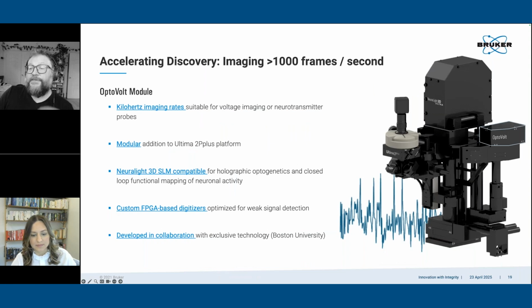There's a reason we have this large footprint, huge microscope: it's a lot easier to optimize optics and customize the microscope when it's large, because we can change glass elements and other elements in it. But what's happened now is fiber coupling to two-photon lasers has reached the point where it's actually good, and dispersion is not as big a problem as it used to be.